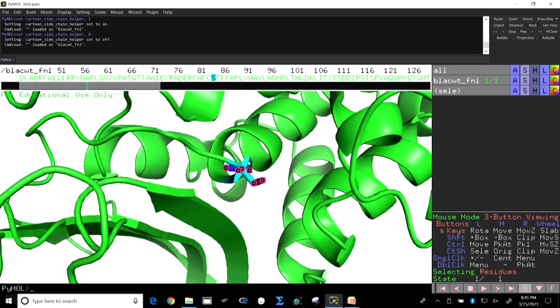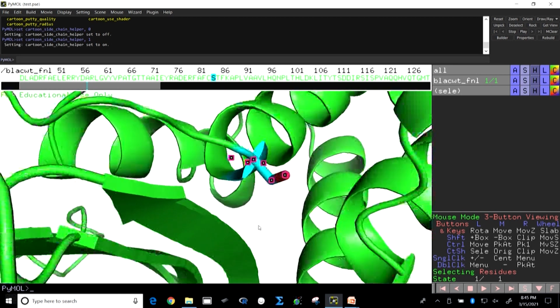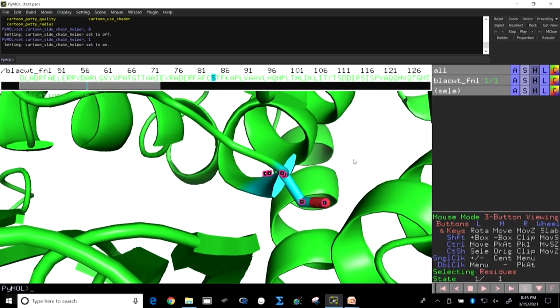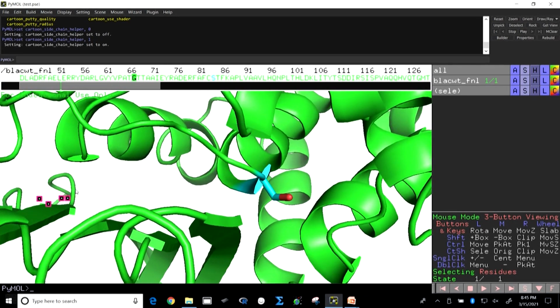Through this, the enzyme performs its catalytic activity, and you see that the serine is represented here. The whole enzyme is represented in cartoon format, whereas we have given a different stick format to the amino acid. This will help you to identify the amino acid, and it will further help you to identify the interaction of this catalytic amino acid with other ones.